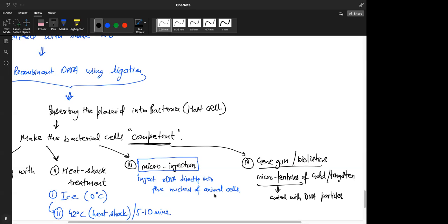So this is called gene gun or biolistics. And there is one more technique where we use pathogen vectors. So we actually use the vector itself, like the virus. That was done exactly in cases of making vaccines, COVID vaccines, where we used adenovirus vector. So we just take the virus and take out its genome, just the capsid, and put whatever we want to send inside the cell in that vector. And then we rely on the virus's mechanism to just do what it does.